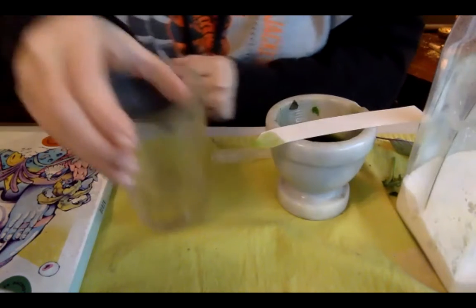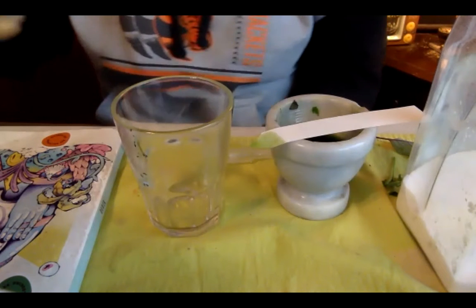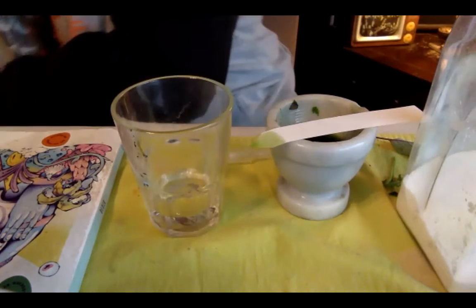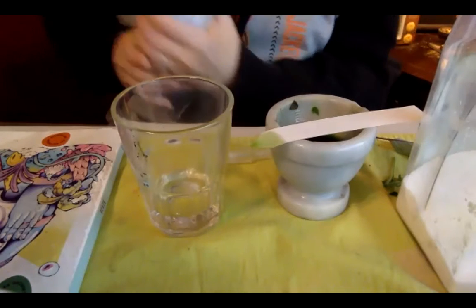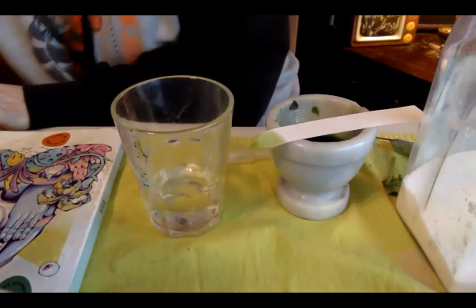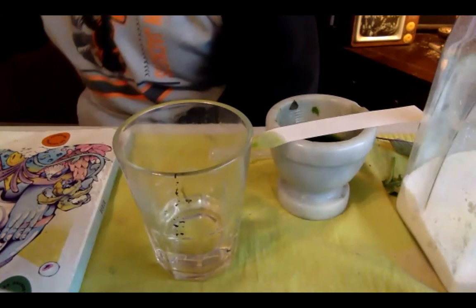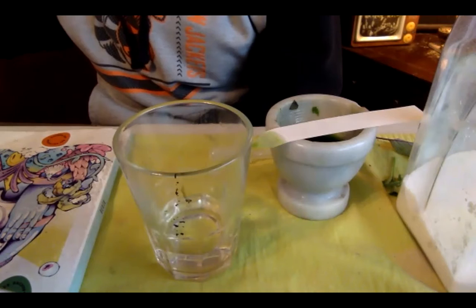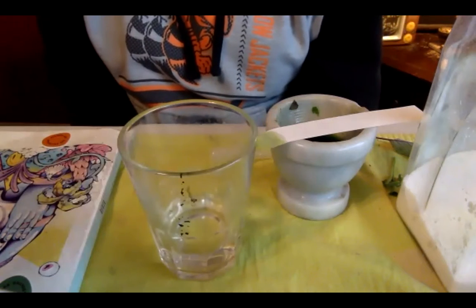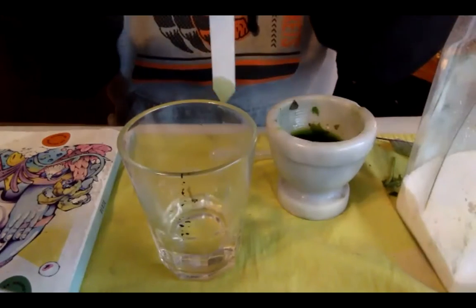Okay, so the chromatography solution, I'm basically just going to do half and half tap water. We have a well, but just tap water. It doesn't have to be DI water even. And that rubbing alcohol, kind of eyeballing it, half and half. You don't even have to measure. I want to say your manual says something like a half an inch of water, which is a rough measurement, but I can't remember. I think you're doing that in a test tube, so it's a different diameter. I just want it deep enough that I can get that tip of the paper in and not much else.